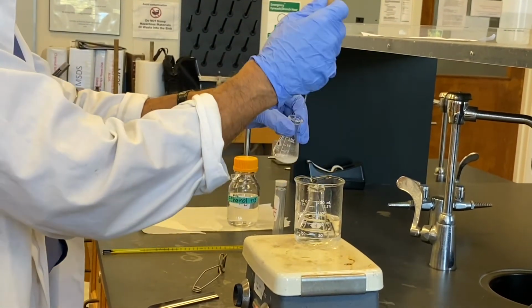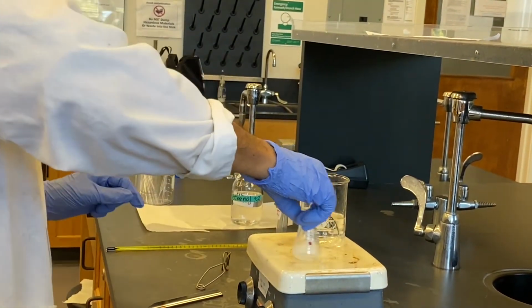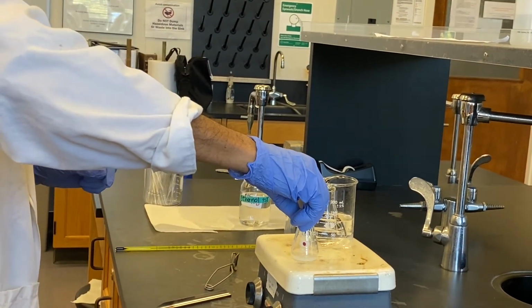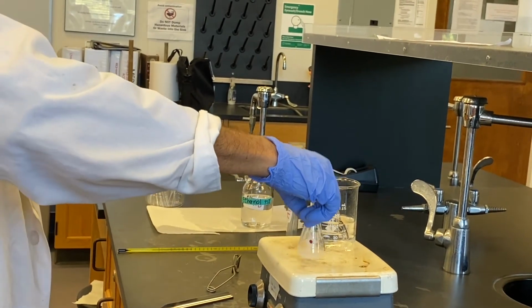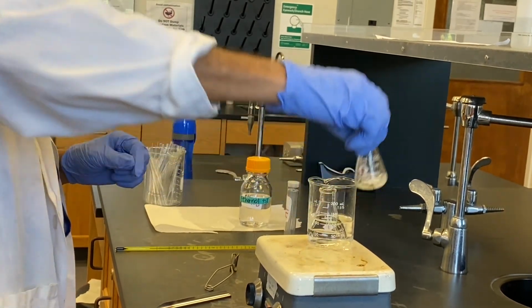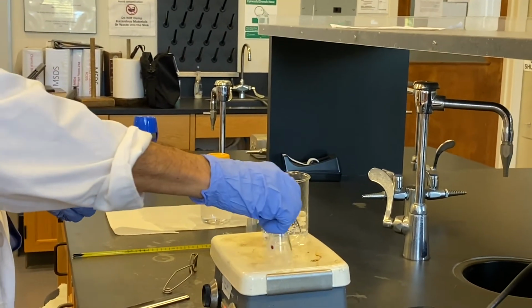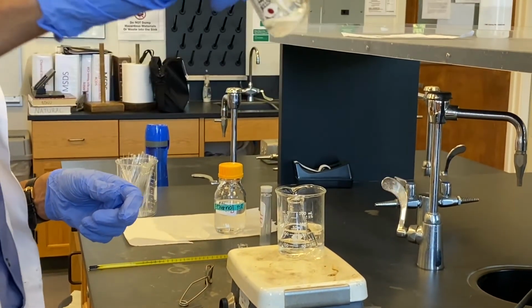So let me add a little bit more alcohol. Let's see. Add more alcohol. You can see it is dissolving now. It's getting thinner. Sometimes we have crystals, then it takes a little bit more time to break them. Okay, you can see it's almost dissolved, right?